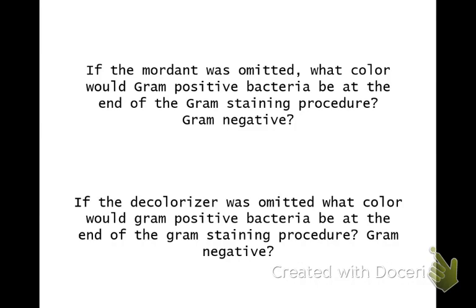If the mordant was omitted, then the crystal violet would come out of both sides, and they'd both appear red. If the decolorizer was omitted, then the crystal violet wouldn't come out of either, and they'd both be purple.